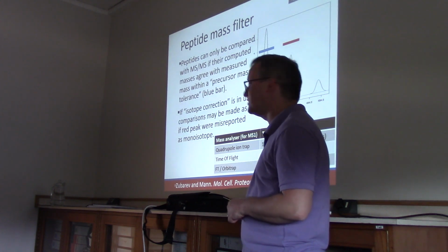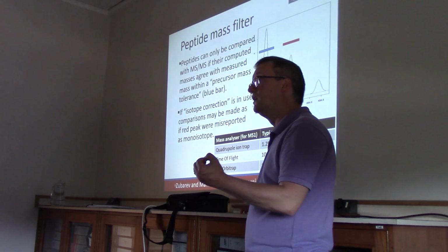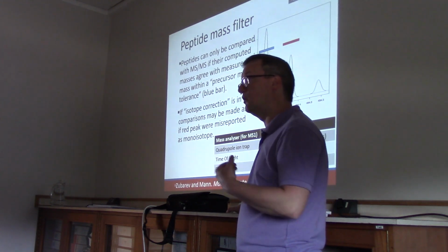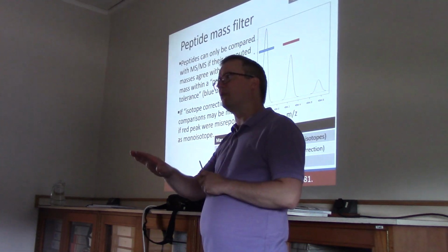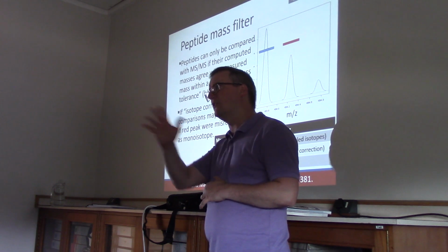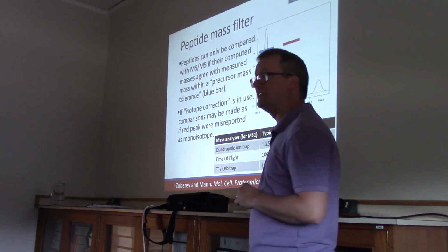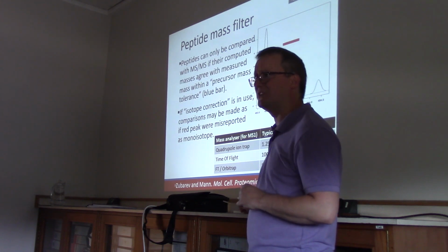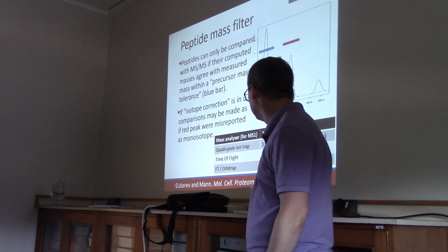And I've written that you can assume a mass error of 100 ppm, parts per million, for their precursor mass accuracy. That's easily within 0.1, and more typically within 0.01 of the true mass of that peptide. 100 ppm, frankly, is an underestimate of how accurate today's mass analyzers are from the QTOF family.